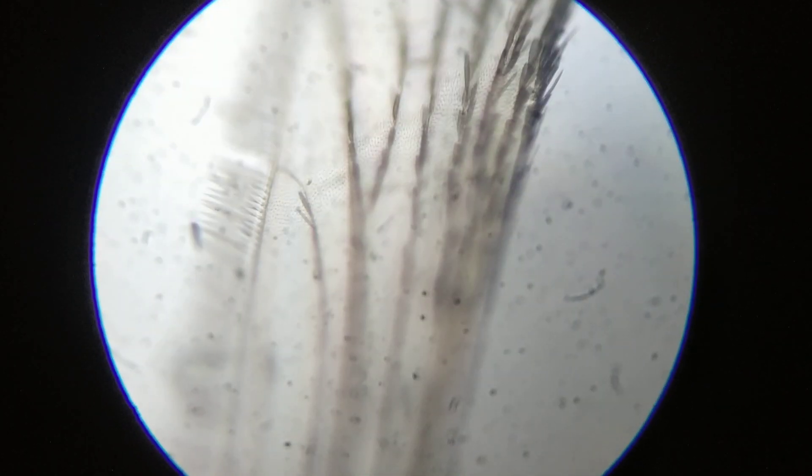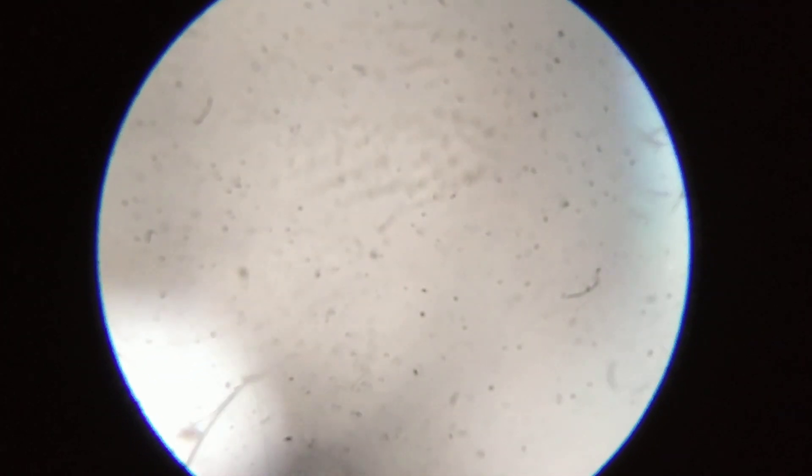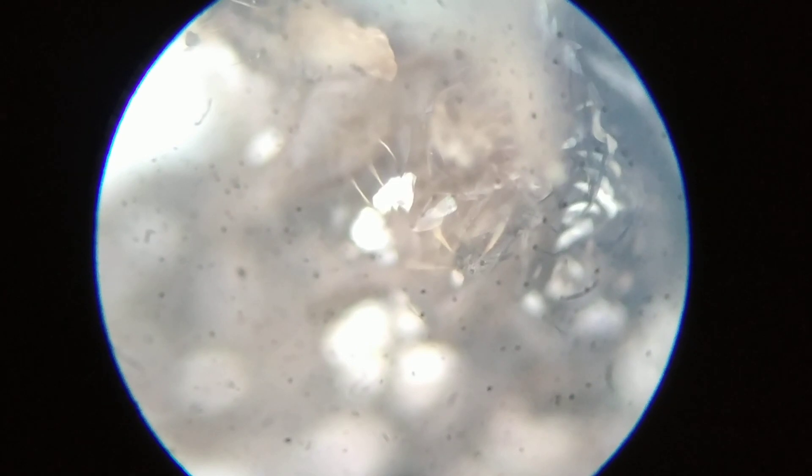This is its wing. How delicately designed by nature. Thank you.